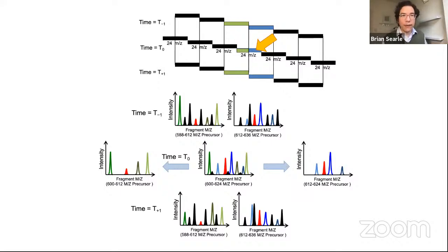So you can definitely do the integrations for them, but you treat them as independent detections and interpret them on their own. For example, if you've got your normal library, you can add in the stable isotope labeled library, or for those specific peptides at least. So that's a fantastic question. There's actually new tooling in the new 1.2.2 to be able to deal with that type of library addition.